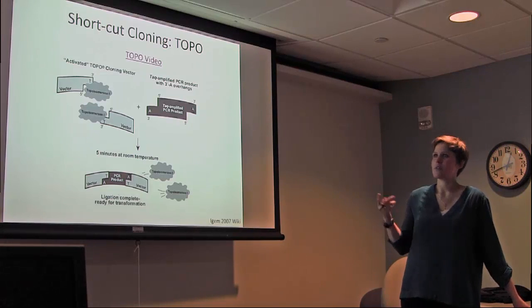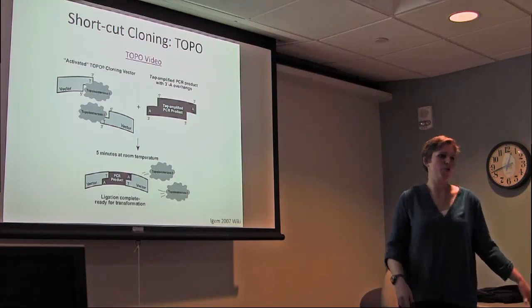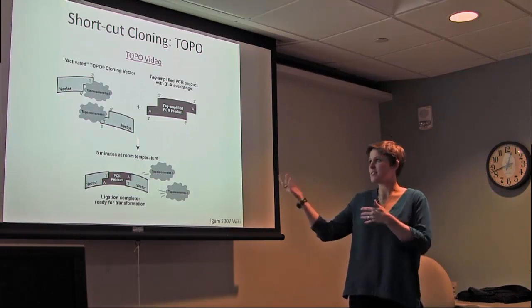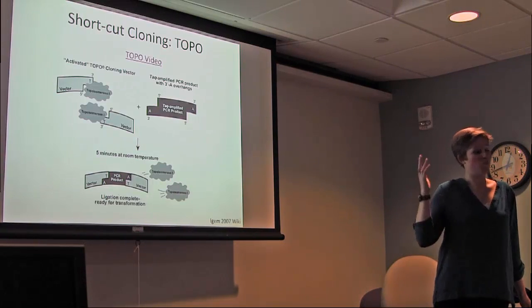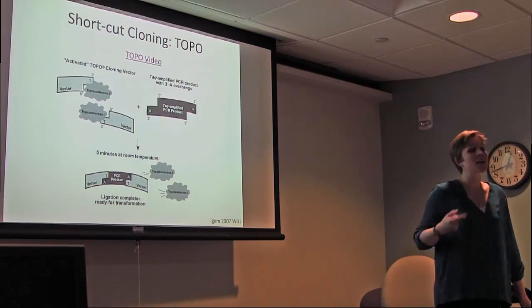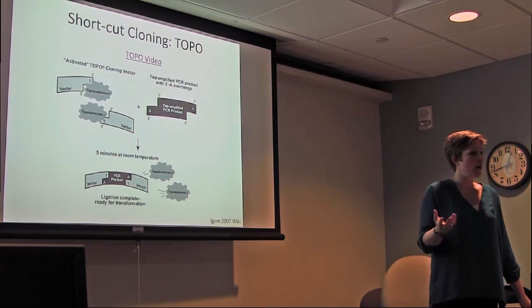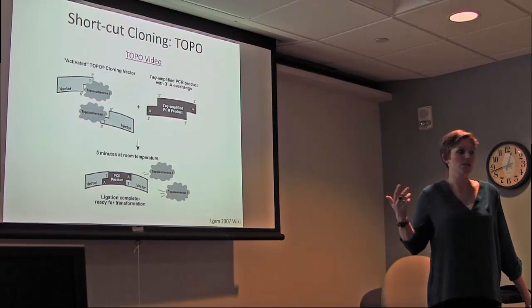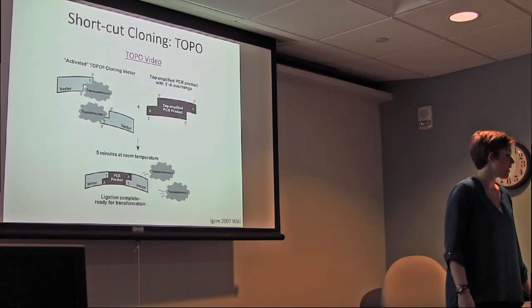I mean, I bought one recently that had a V5 tag on the N-terminus. So you can basically just have, I put my gene of interest into that vector, and very easy process. But again, the planning's still important. You have to make sure you know which PCR polymerase you're going to be using so that you know which kit to buy, but super easy to just go on the Invitrogen site and figure that out.